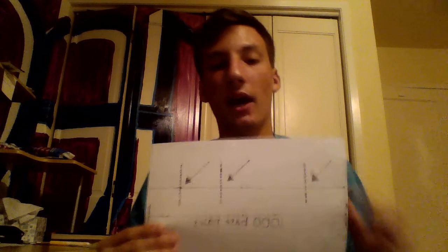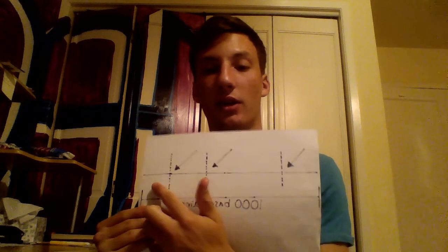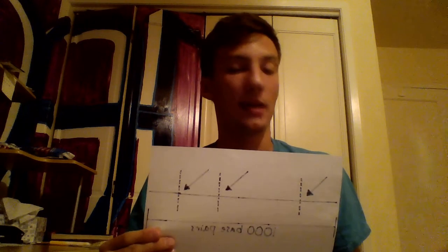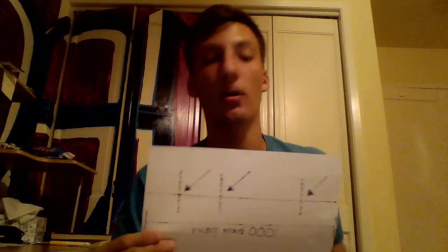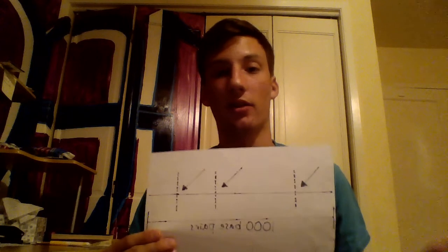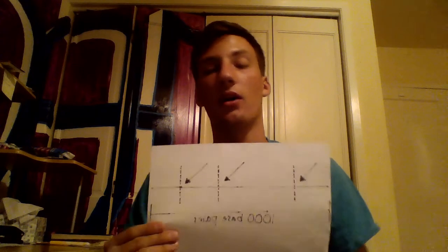And so once we have these 4 different inserts, as you can see here, after the 3 cuts, you have 4 different separate sequences now. We can, or our boss, essentially, to make the agar plate, attached these inserts, that we can call them, onto a vector backbone, which is another sequence of DNA that's part of the duckweed colony. And also something to keep in mind too is that these inserts have the antibiotic resistance, which I'll show you here.